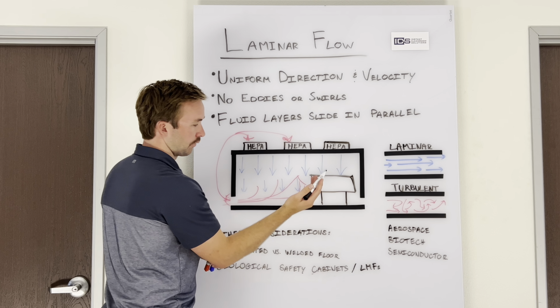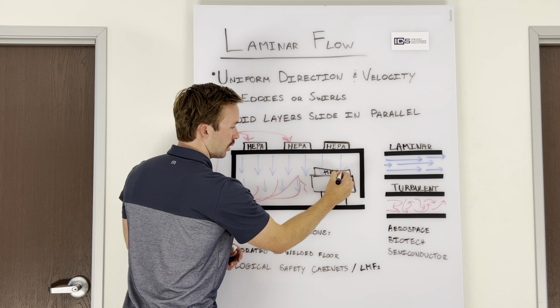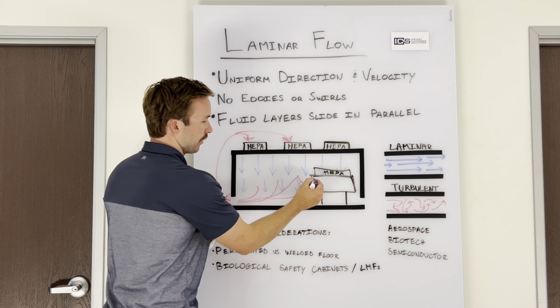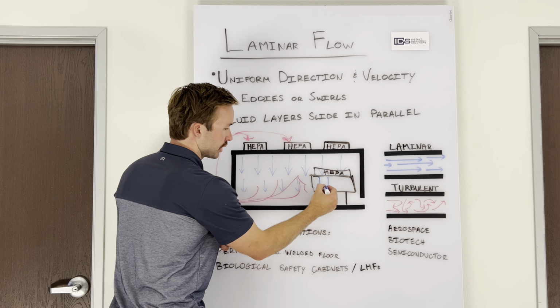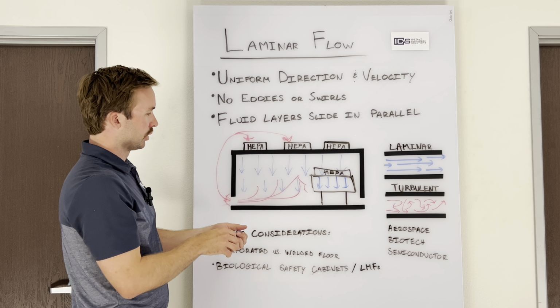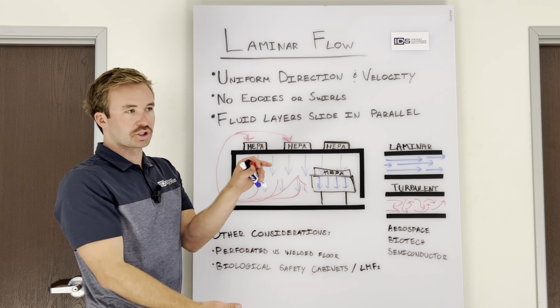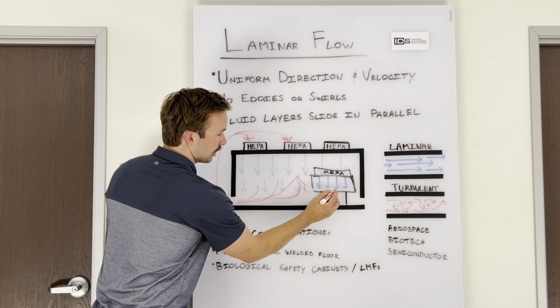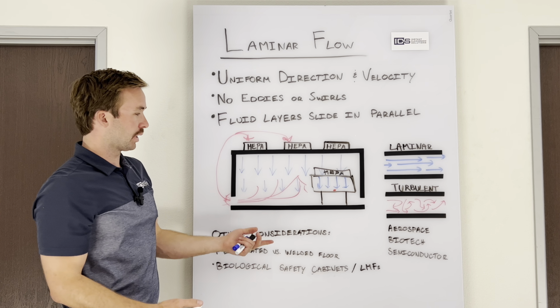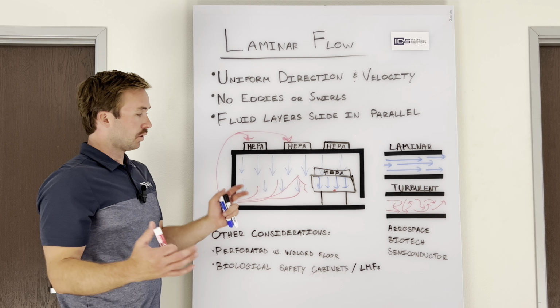Now, laminar flow hoods are either vertical or horizontal. Let's just make this a vertical one, and we'll just put a HEPA. This is vertical. So right there, in this situation, we're going to have laminar flow going right over a workstation, just like this. And it's a lot less susceptible to turbulence in the entire room because it has its own dedicated area that's just maybe 24 inches above what you're working on. If you're working on something right here, it's going to be providing clean air that's HEPA filtered right over your workstation. And biological safety cabinets and laminar flow hoods are certified ISO 5. So that's incredibly clean air right over that workstation.